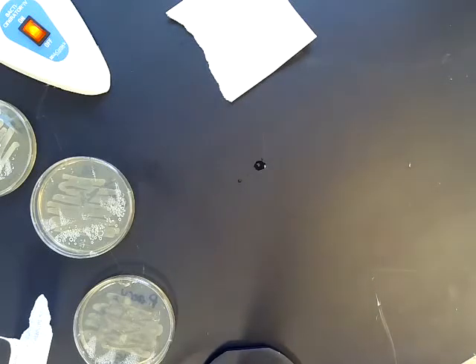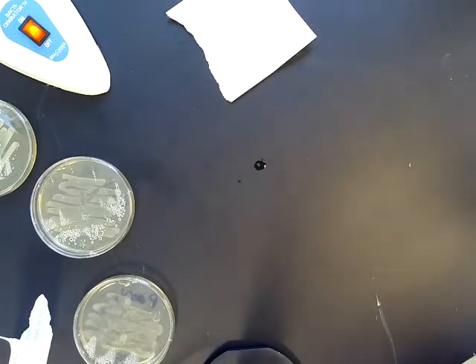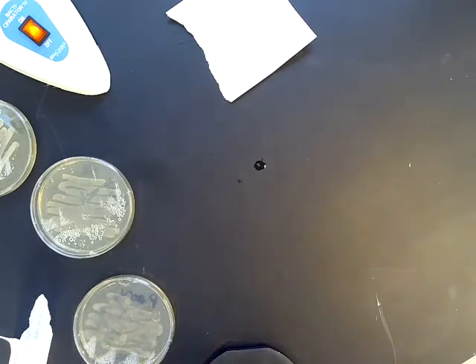The M is for methyl red. Methyl red is a test that tests for mixed acid fermentation. If the microorganism does mixed acid fermentation, you're going to incubate it in this specialized media, and then you add methyl red to the tube after, and that's going to cause a red color change if it's positive.